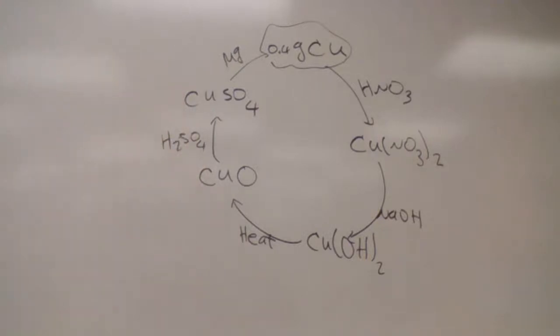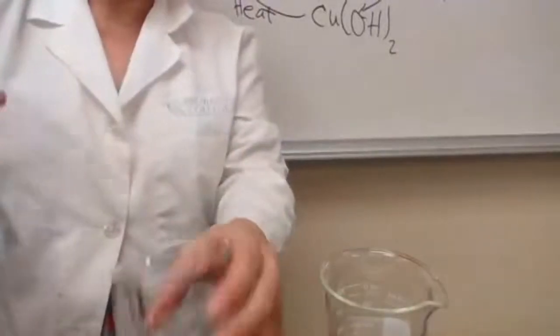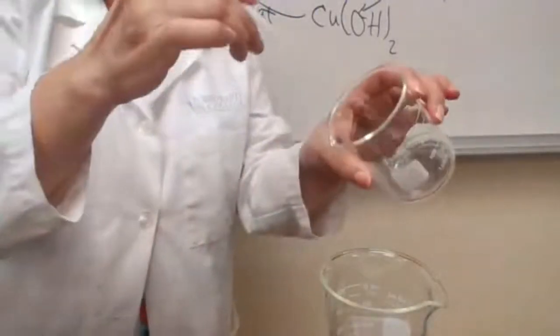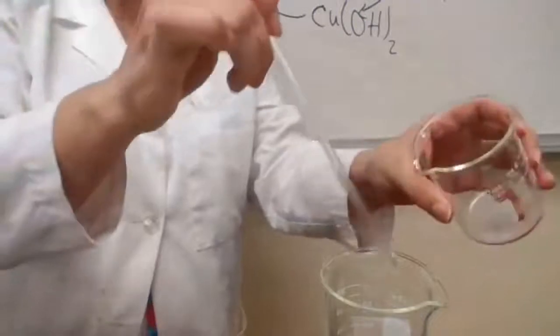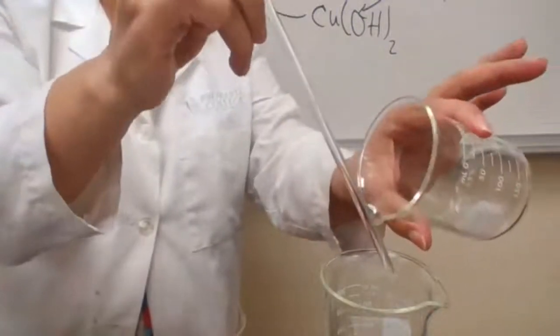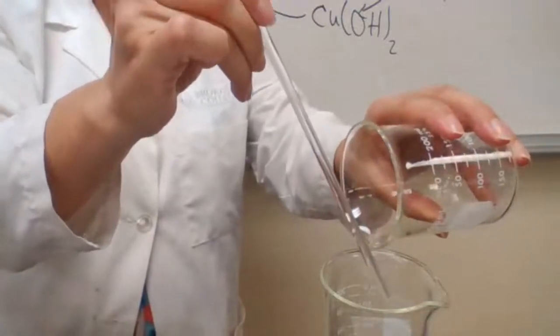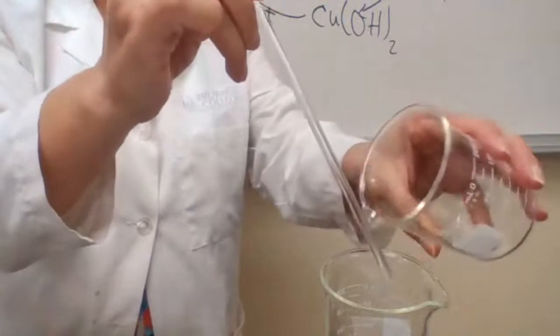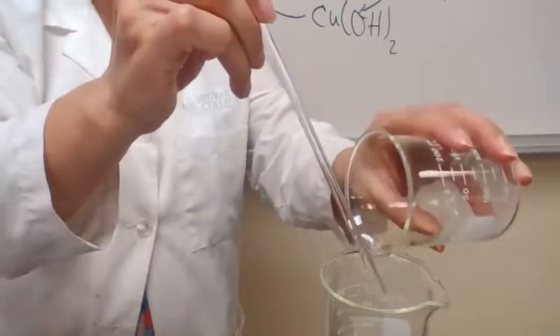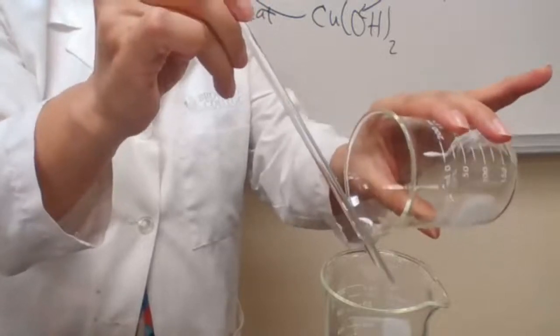When I do the experiment, I'm going to actually show you how to do the decanting part. But just as a demo, when you have a mixture of the liquid and the solid in one beaker and try to decant, you are going to use a stirring rod. You hold the stirring rod at a 45-degree angle, and then slowly you pour only the liquid portion, and you are careful that no solid is transferred. So that's one of the techniques, decanting.